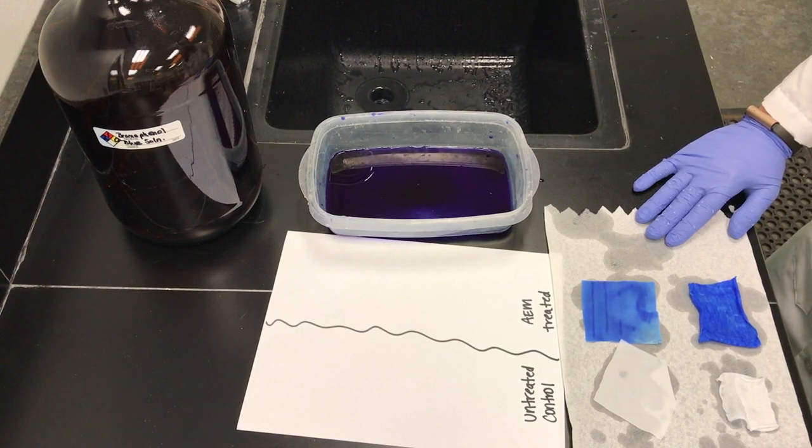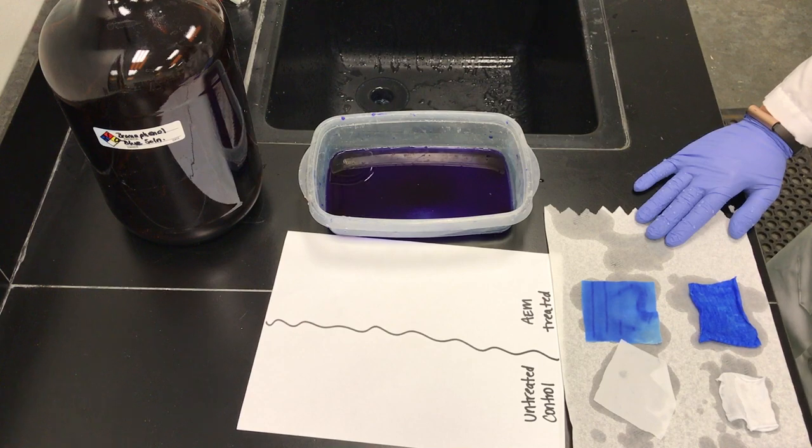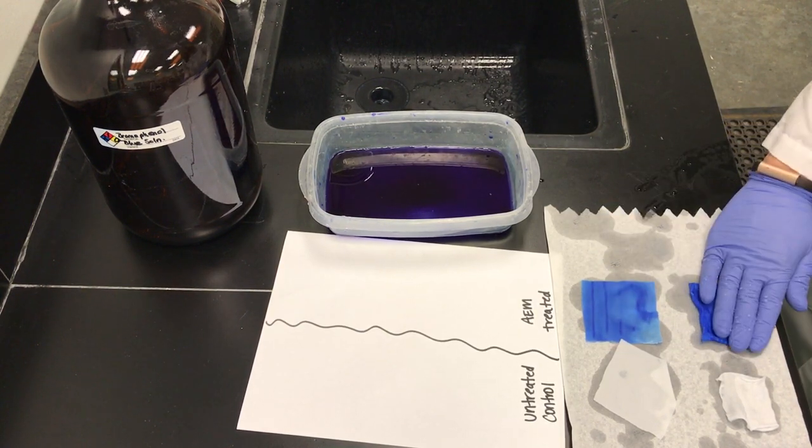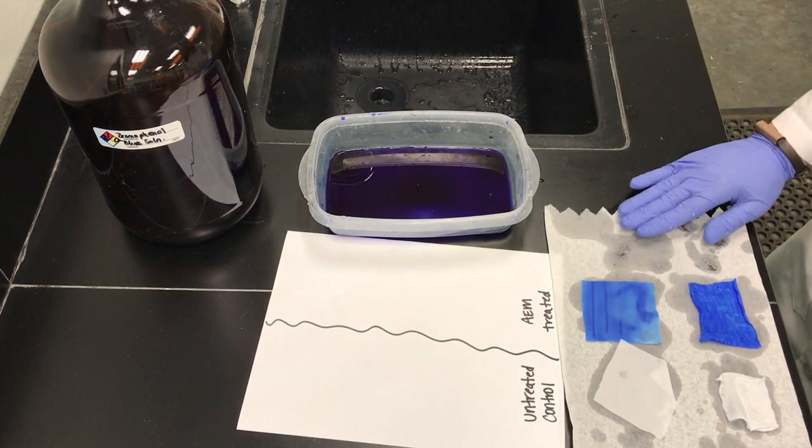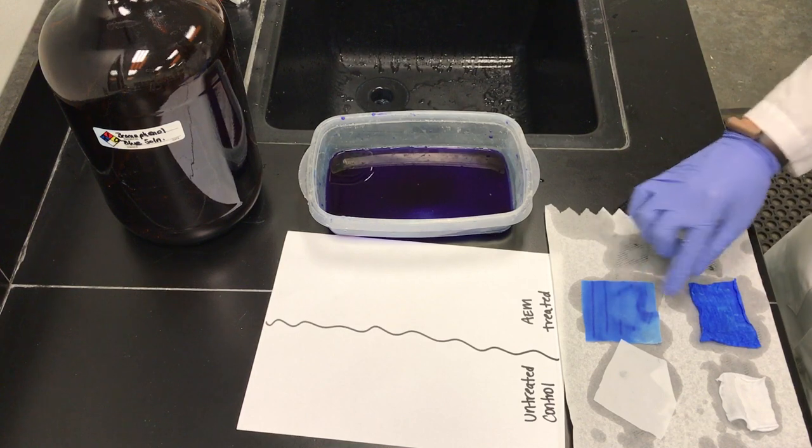Two different fabric types that are treated at the same application level can show differences in staining and intensity. These two fabrics are 100% cotton and 100% polyester and are treated at the same application level. Notice the difference in intensity.